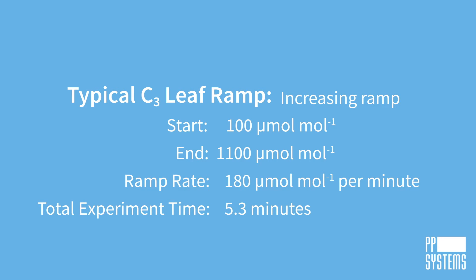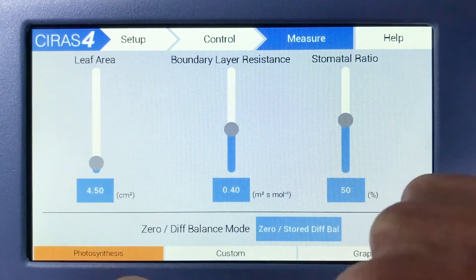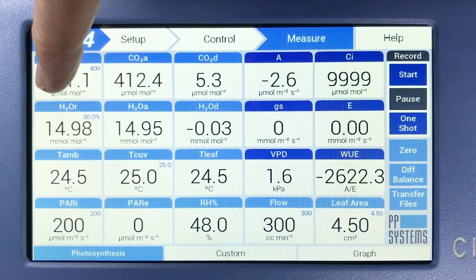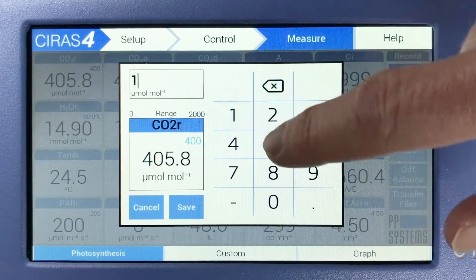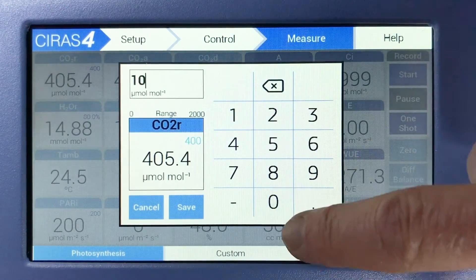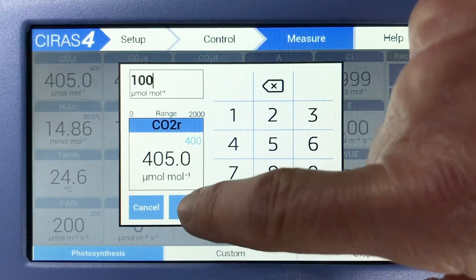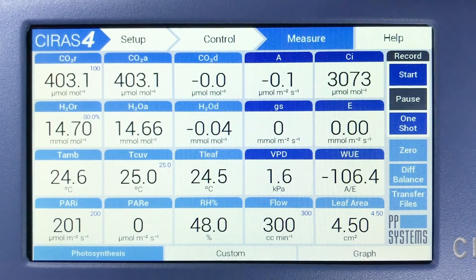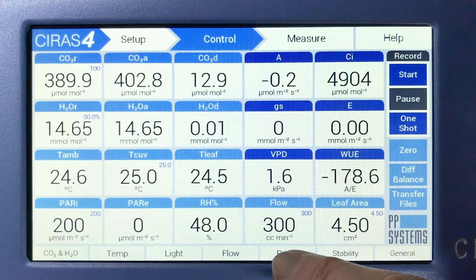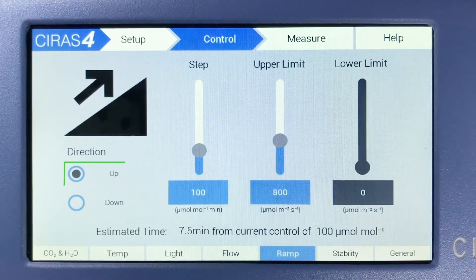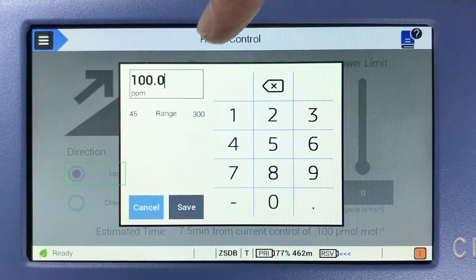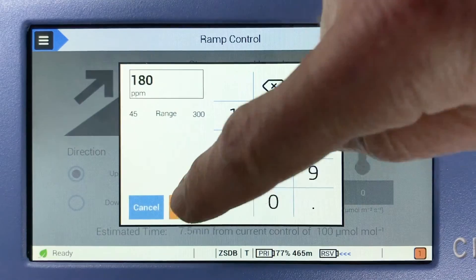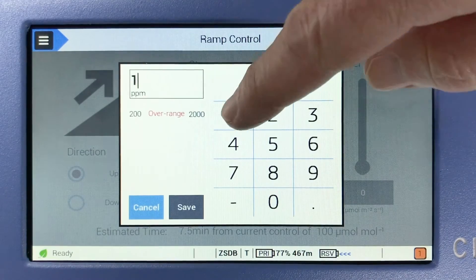To set the ramp criteria, first navigate to Measure, Photosynthesis, and tap the CO2R tile. Set the starting CO2 for the ramp to 100 micromoles per mole. Next, navigate to Control Ramp. Be sure the direction is set to Up, the Step to 180 micromoles per mole per minute, and the Upper Limit to 1,100 micromoles per mole.